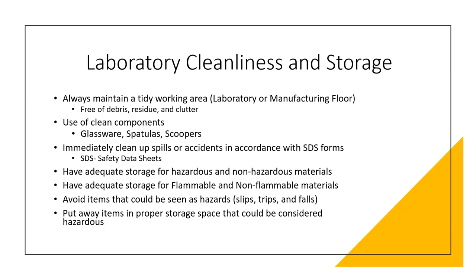Use of unclean and unwashed glassware or components could render inaccurate results, which also could result in a waste of energy and time. So we want to make sure that we use clean glassware, things like spatulas and scoopers. So, for example, if you are using a scooper for one chemical and you move on to another one and use that same scooper, you have now contaminated both chemicals, and that could render inaccurate results at the end of your testing.